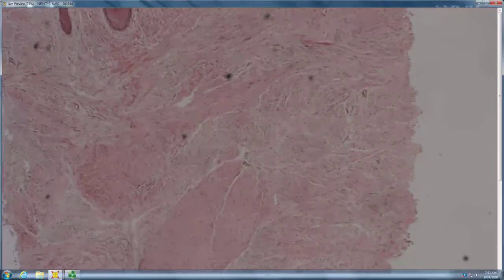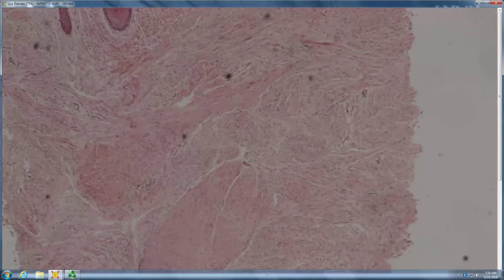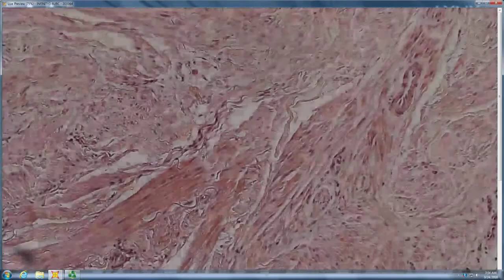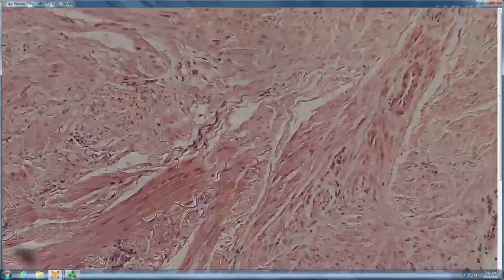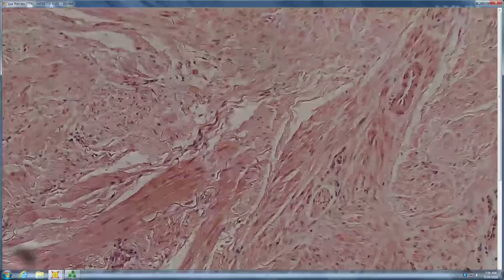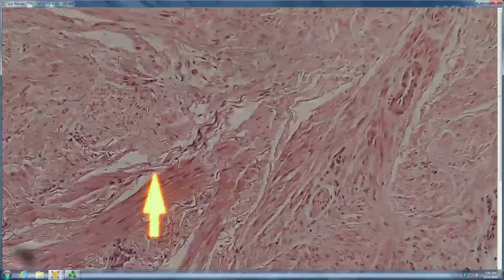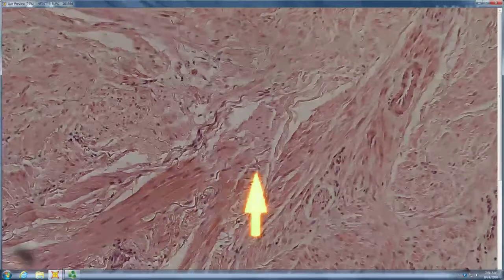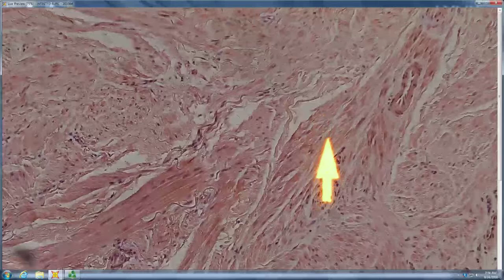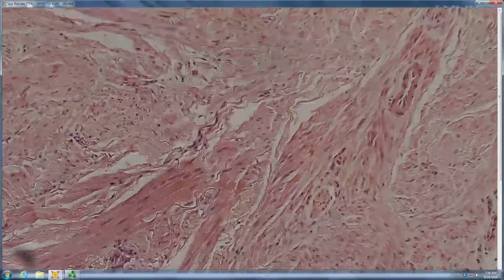So, got some kind of pale pink structures in this. Not sure what those are. And so what kind of tissue do you think that is? Collagen. I'm not sure. When you look at the nuclei, are they pointy or are they more blunt? They're more blunt, so that's muscle. And you have little vacuoles, little glycogen snacks there because they're working hard contracting. Right. So if that's all smooth muscle, then what would you think?